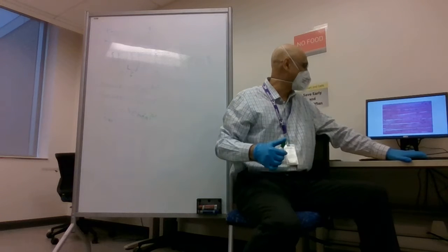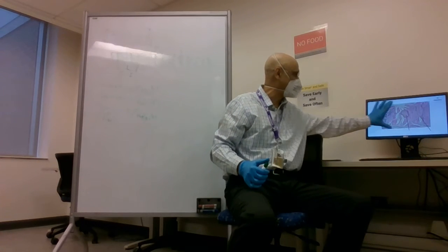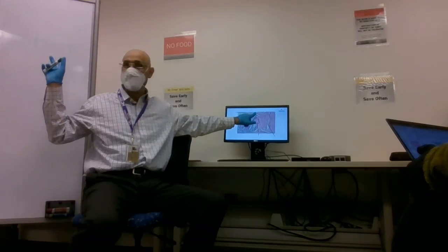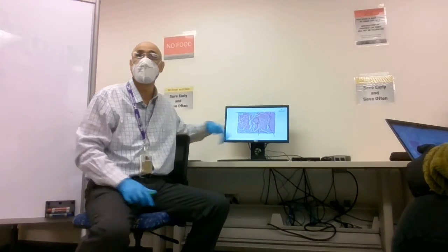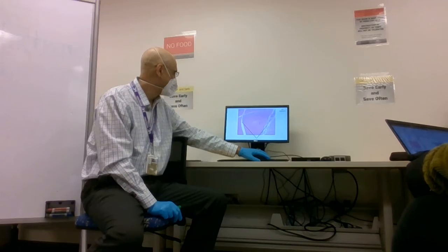So when you look at a picture like this, and again, I'm not saying it will be this picture, but it will be a picture similar. You can see the whole muscle here now, right? This is the whole muscle. So if this is the whole muscle, any connective tissue on the outside is called what? Agree? And if it says, what are these regions called? This region or this region? It's a fascicle. And around the fascicle, you see connective tissue. What is it? And you don't see the endo really nice here.